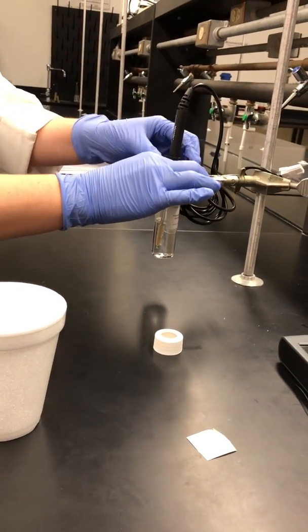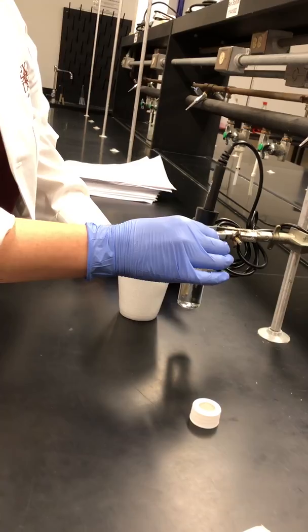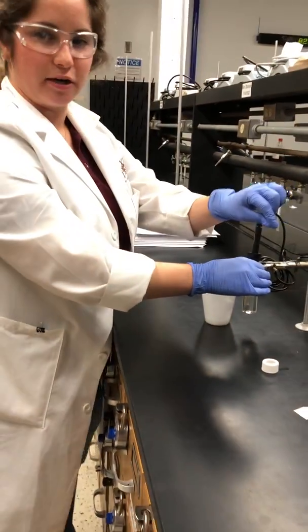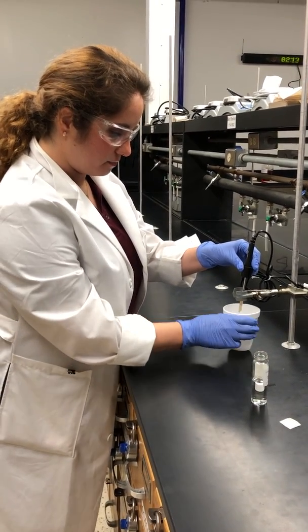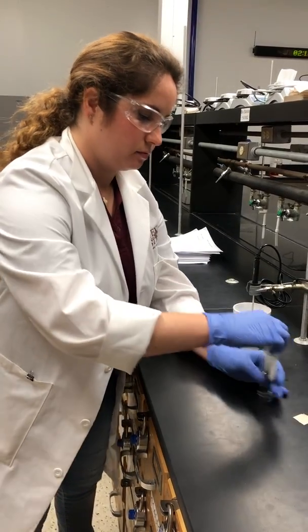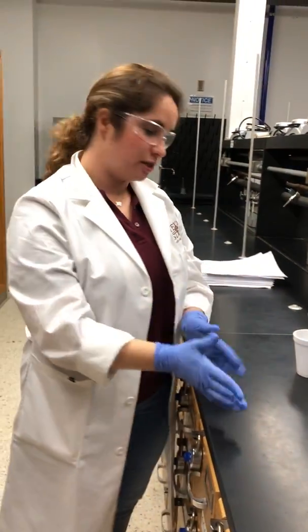Once the temperature has equilibrated, you're going to want to act pretty quickly. Push play on your LabQuest and start collecting data, and once data has started appearing on your LabQuest, quickly but carefully remove the alcohol and put your probe inside the cup. Then seal your alcohol sample and put it on the counter so that somebody else can use it, especially if they're waiting on it.